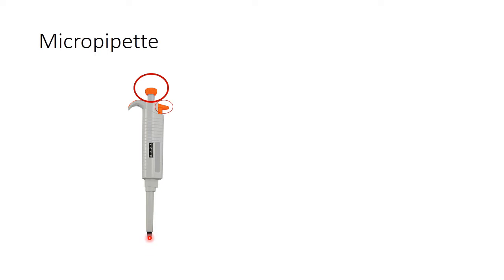This orange colored part is known as the tip ejector. It is used to remove the disposable tip after use.